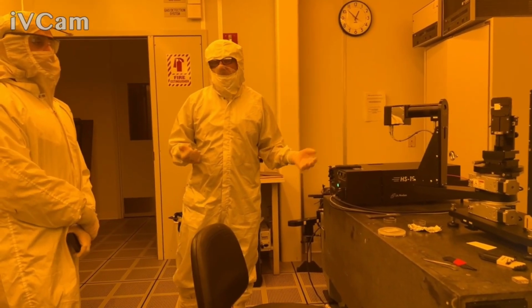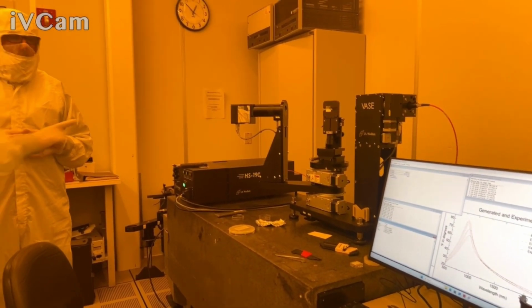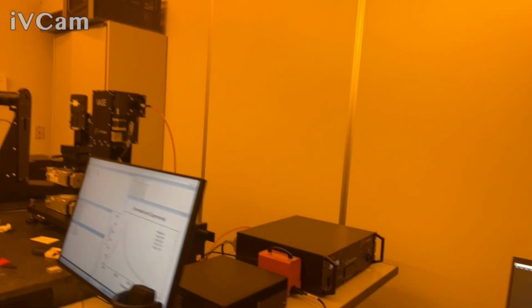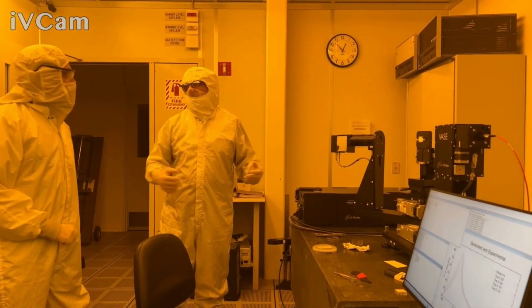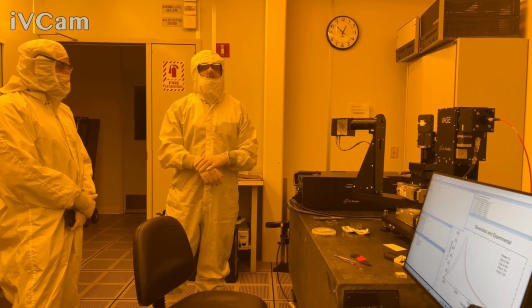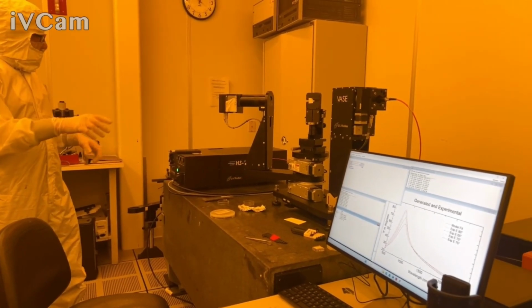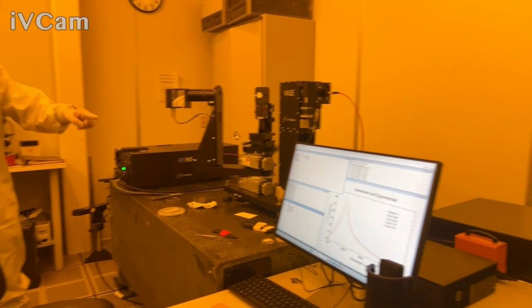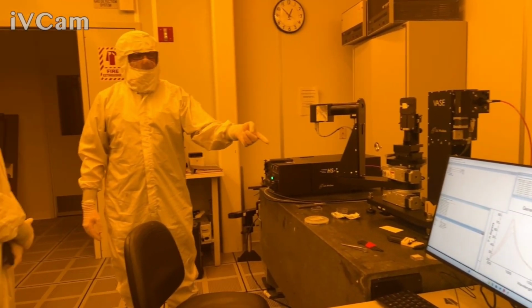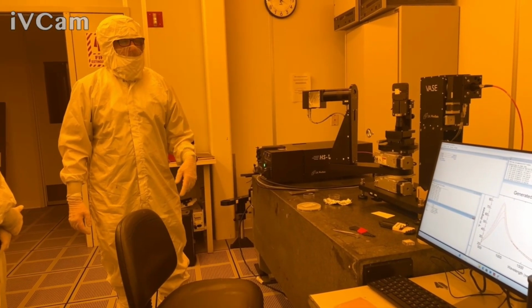Sure. And if you turn off the software, you'll have to recalibrate. But during a planned outage, I would turn everything off, even the computer. You don't want the computer to just lose power. Turn off the software, then turn off the box, turn off that box, turn off the computer. Maybe even turn off the vacuum pump. As long as it's closed, it shouldn't hurt it.